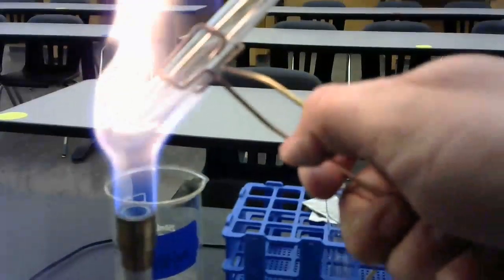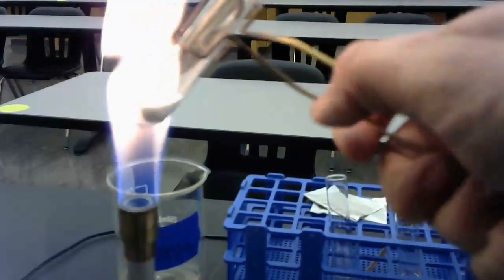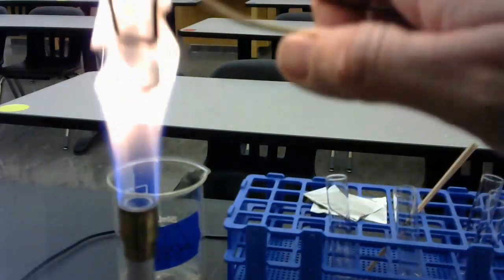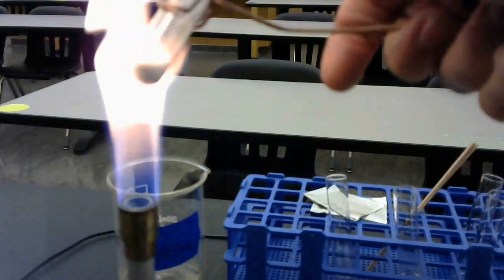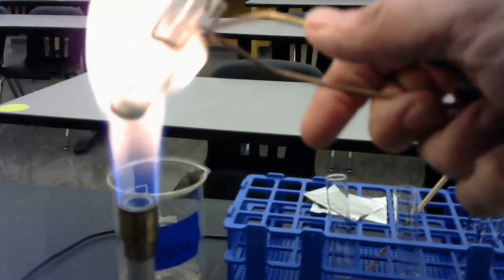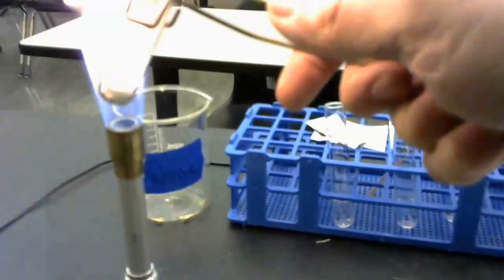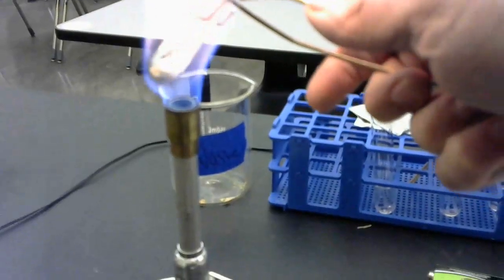And I don't want to point my test tube towards any students, so I'm pointing it away from me. I'm heating right there at the surface of the sodium hydrogen carbonate, or sodium bicarbonate, also known as baking soda. If you look really carefully, you can see a little bit of condensation on the top of the test tube, which is indicating that there's some kind of water being released.